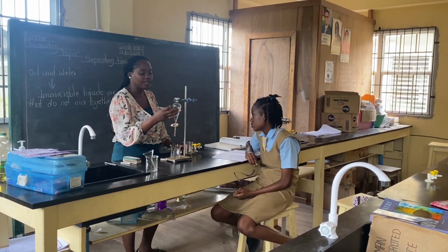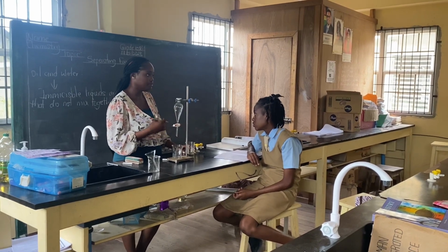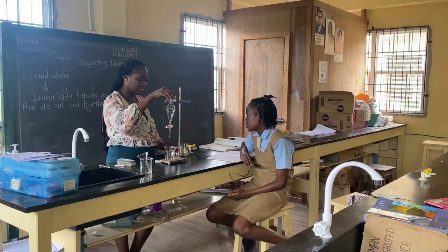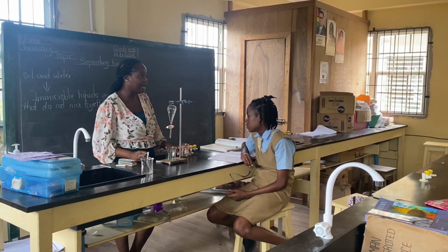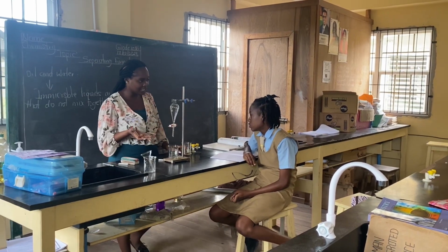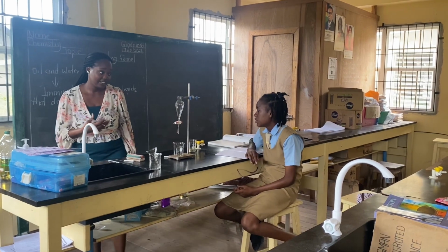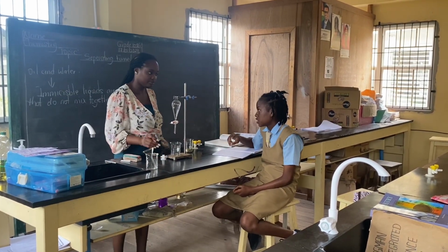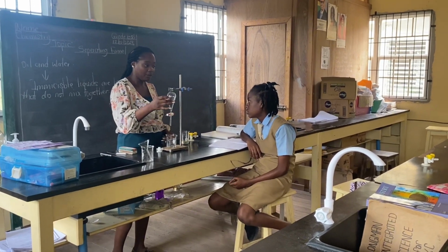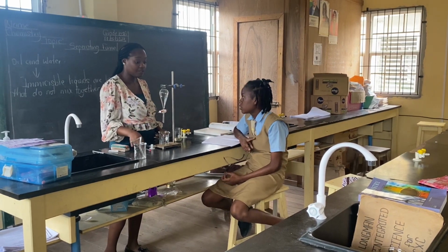Question: in order to separate our oil from our water, we will have to add it to our separating funnel. Do you think the position between the oil and the water will be switched when we add it to the separating funnel? Because this is a fancy looking apparatus, right? Yeah, I think so. You think it would? Yes, because I think that the water will come out first and the oil. You think the water will, so will the water be at the top of the funnel or at the bottom? At the top. The water will be at the top.